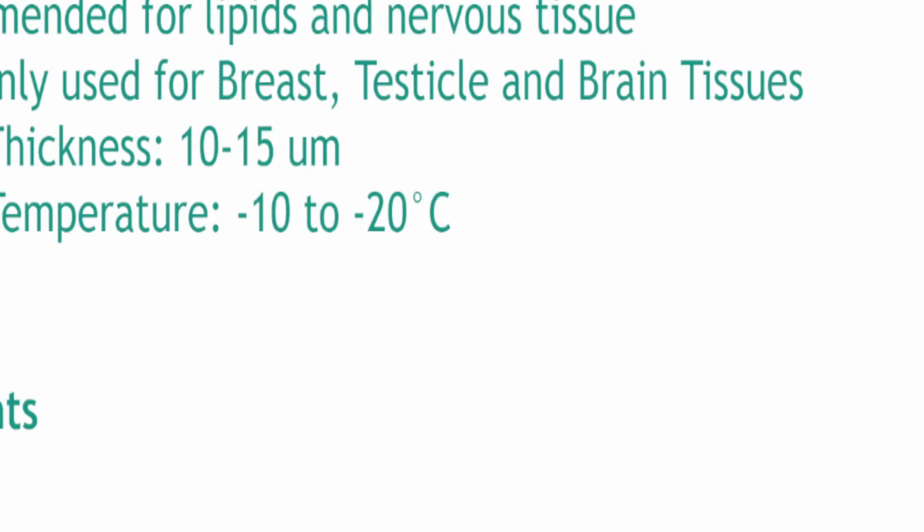So see, there is a certain level of common sense there talaga. Sabi, bakit kaya bone tissue yung nakalagay dun? Siguro bone tissue, mababali yung ano, kasi kailangan mo pang i-decalcify, di ba? Advanced na kaagad siya. Napunta na kaagad ng decalcification.